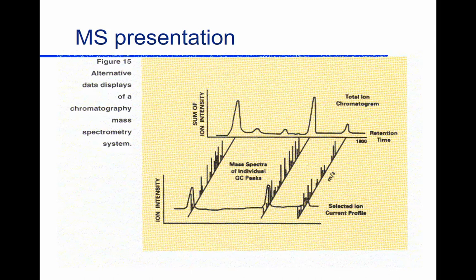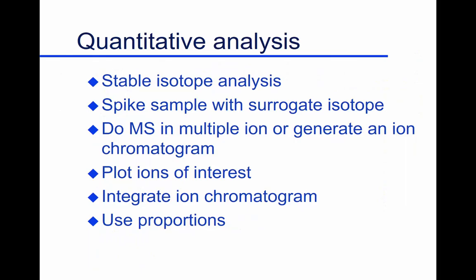And if we want to know what this is, of course, we'll put a cursor up here, go here, and see what this is. So we can look at it in different places in time as well, to make sure it is just one component. There's a lot of ways we use this for quantitation.